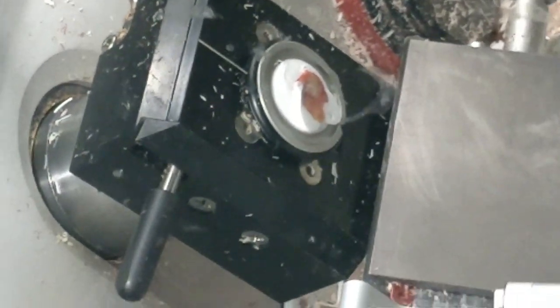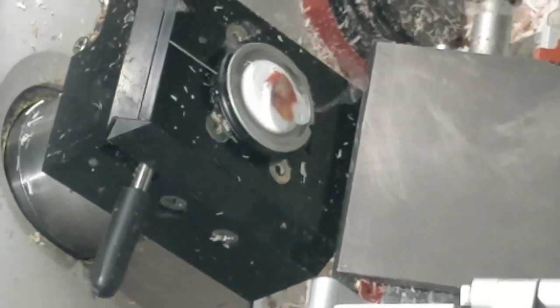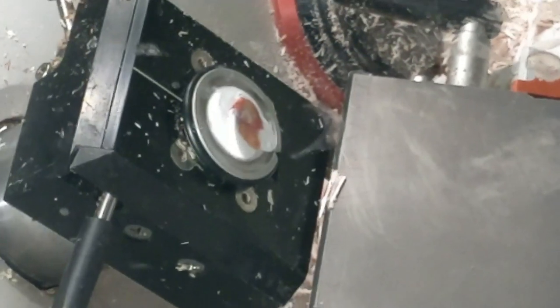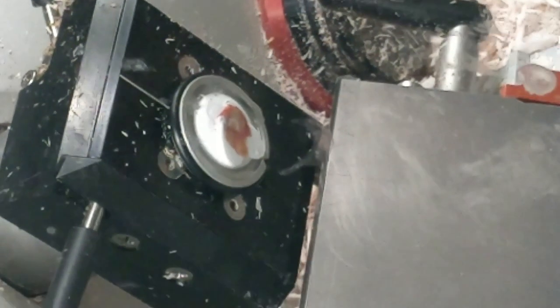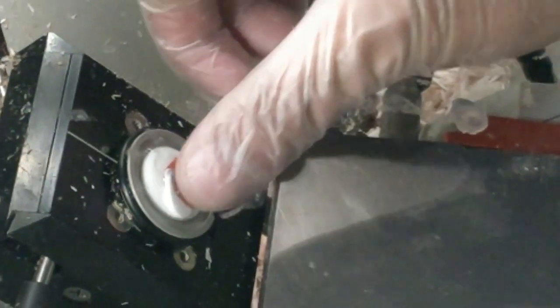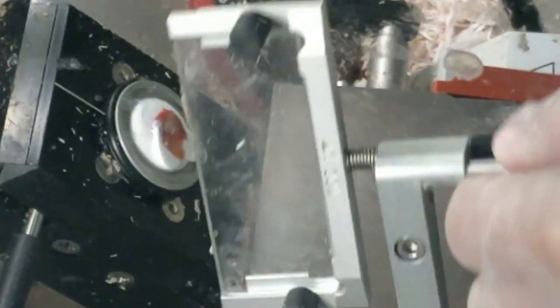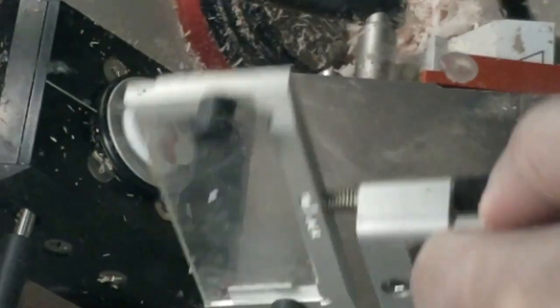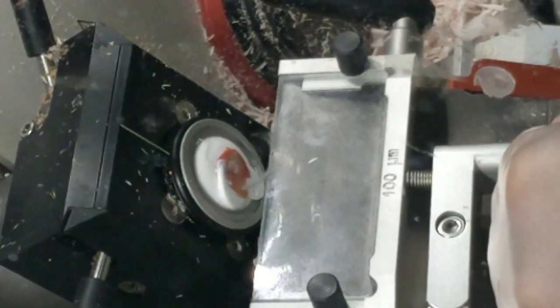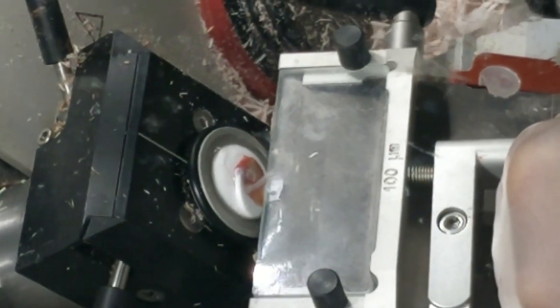And then so then we can section. Once we section after trimming, we can put it on a slide. That's the capture device.